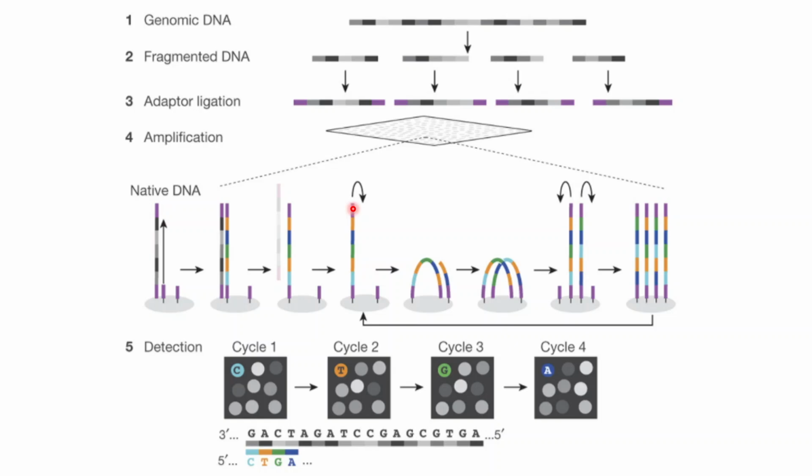Then you need to do quality control, because some of the reads that I will be getting here would have low quality. Most of the reads that have been analyzed give a quality score. The quality score determines how confident that particular read is at that particular position. So you have to do quality control based on that. You have to remove some reads, and you have to trim some of the edges of the reads if the ends are causing any problem and quality is lower at the ends of the forward or reverse reads.